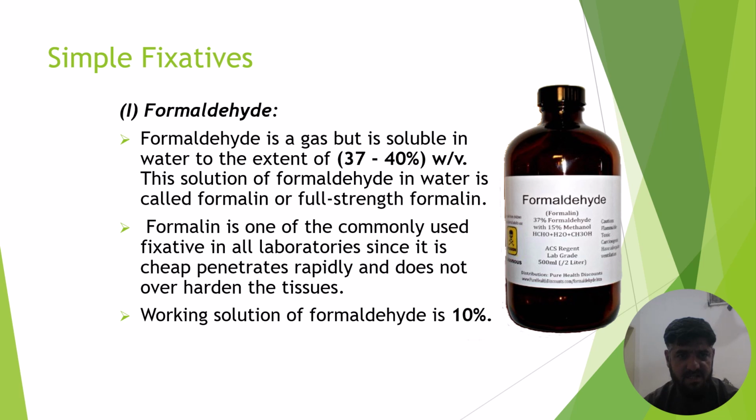So top of the list is the formaldehyde, which is a routine fixative used in the histopathology laboratory. Formaldehyde is actually a gas, but it is soluble in water, and its solubility is 37 to 40% weight by volume. This solution of formaldehyde in water is called formalin or full-strength formalin. Formalin is one of the commonly used fixatives in all laboratories, since it is cheap, penetrates rapidly, and doesn't over-harden the tissue. The working solution for formaldehyde is 10%.